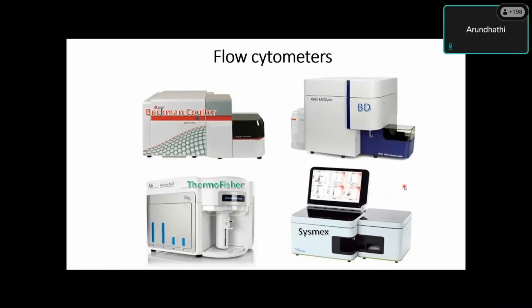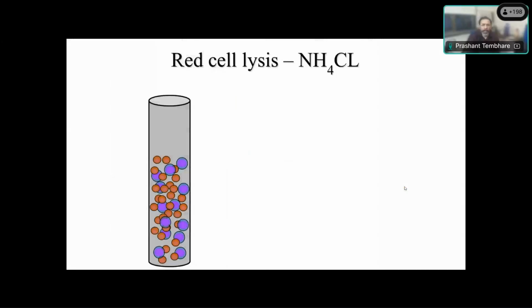Okay, now how do we study the cells in flow cytometry, right? Because I've already mentioned we study single cells.